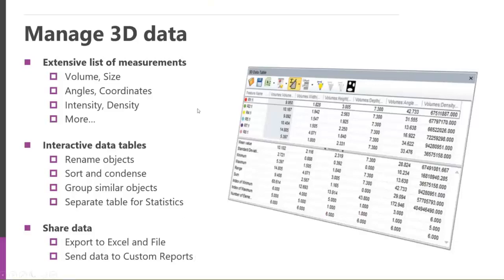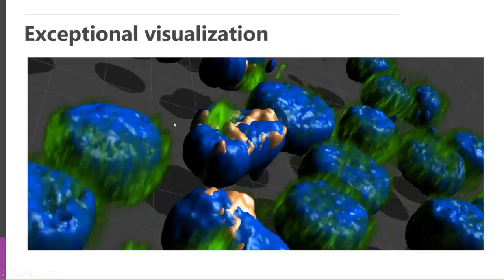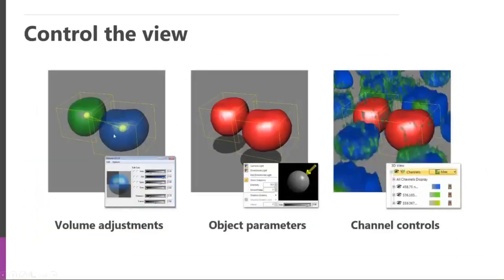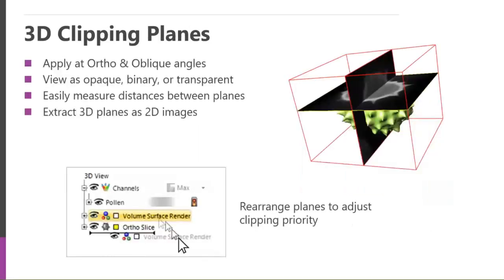We have documentation capabilities too. Within the actual visualization, we have full control over objects and the volumes themselves, channel controls, color, assigning specific colors based on the fluorescent fluorochrome emission, things like that. Lighting conditions, you'll see in a little bit here how important lighting is. Even for the 3D object when it's rendered, helps you to really visualize what's going on, especially sometimes like within a concave surface. It can be very powerful. 3D clipping planes can be added to any 3D data, and you can see on the right-hand side here where you can have 3D visualization, provide some orthogonal planes or perpendicular planes, and then there's a lot of options as far as how those different planes are being displayed.